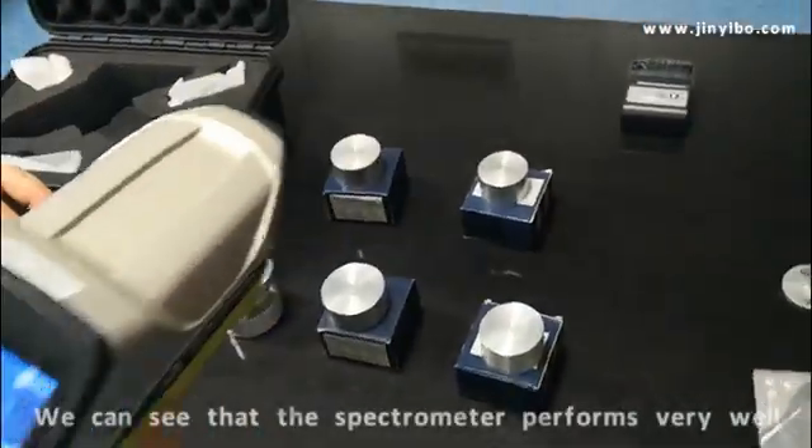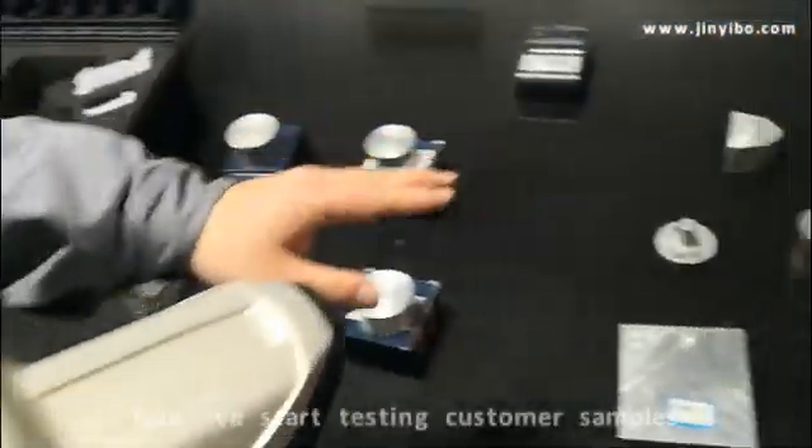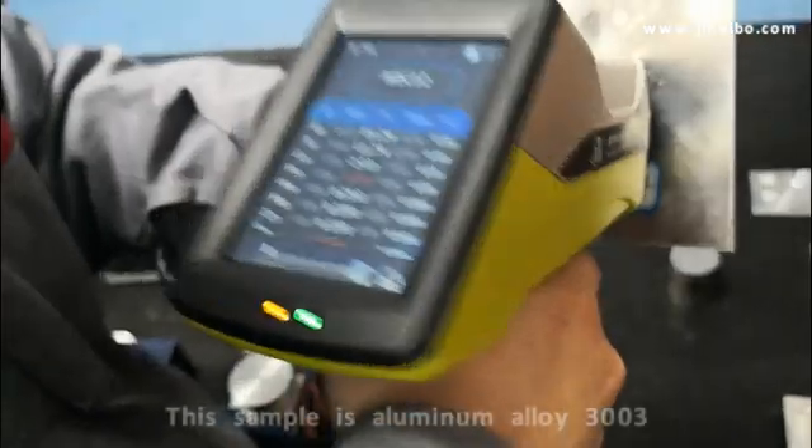For the standard samples, we can see the performance is very high. And now we will test the custom samples one by one to show you the results. This is the custom sample — we put it here.